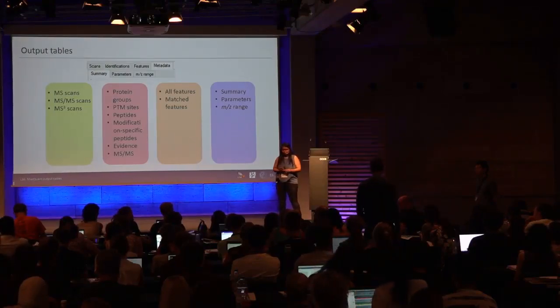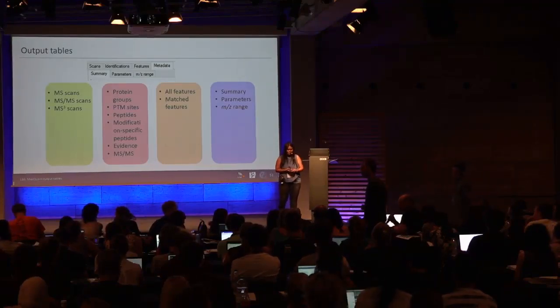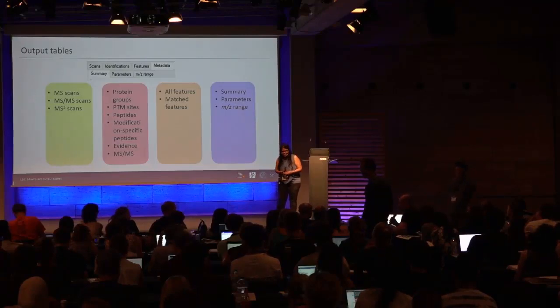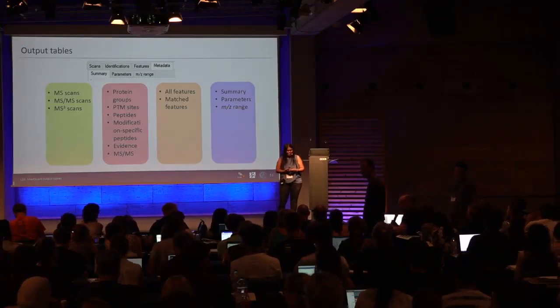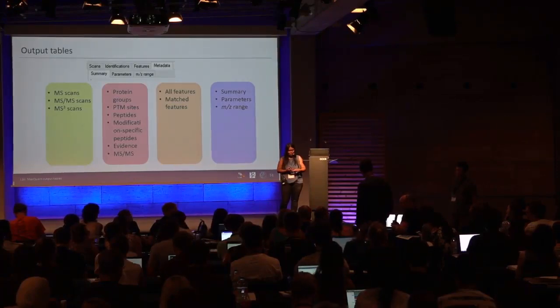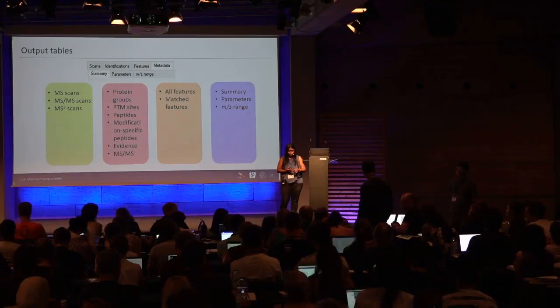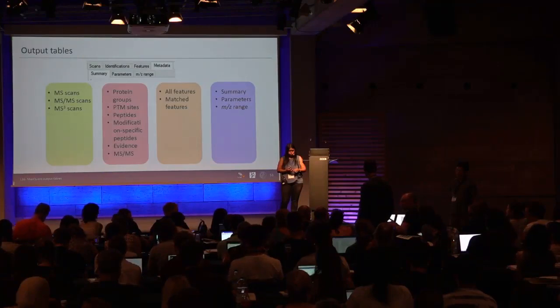Would it be possible? I think you can. I just repeat the answer from yesterday. In principle, it's of course possible, but the problem is that we don't want to inflate the tables too much. That's the only reason why we don't have all possible information in the tables, because at some point they are not really handleable anymore. On the other side, for people who are specifically interested in this kind of information, there's actually a way to generate it. You just would have to rerun MaxQuant, basically.